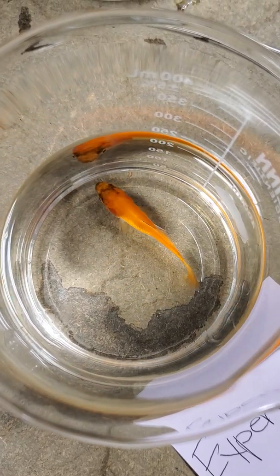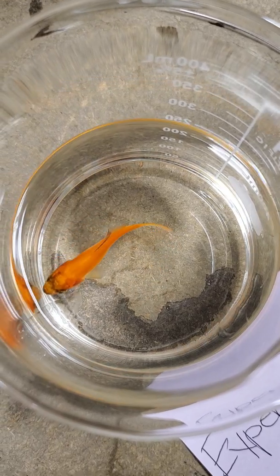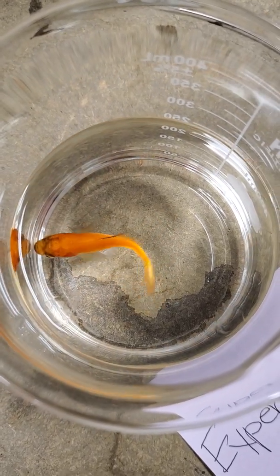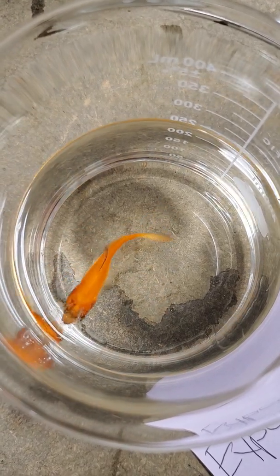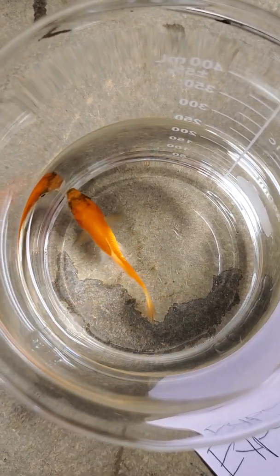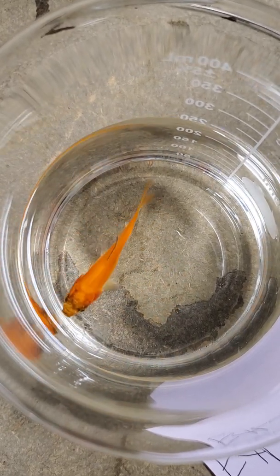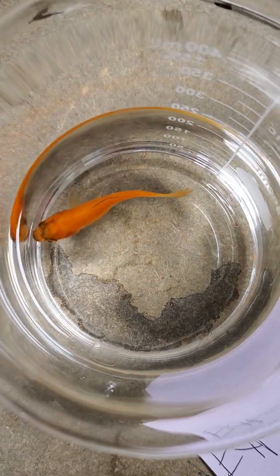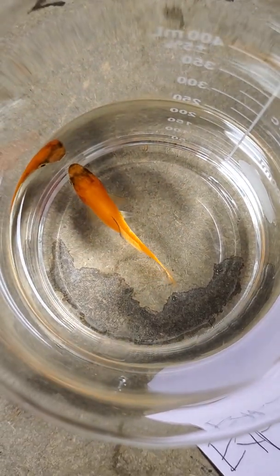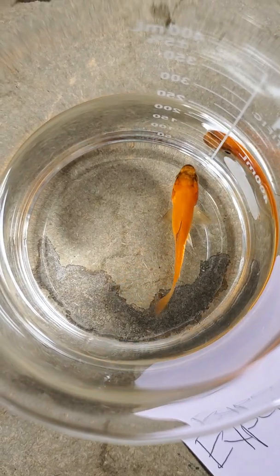I know it may be a little hard to see when he's breathing. Just do your best to count how many breaths he's taking, or his respiration rate as we're going to call it. So if you can see his reflection opening and closing his mouth, or see his gills going in and out. I know it's kind of hard on this guy, but do your best with it. And time.